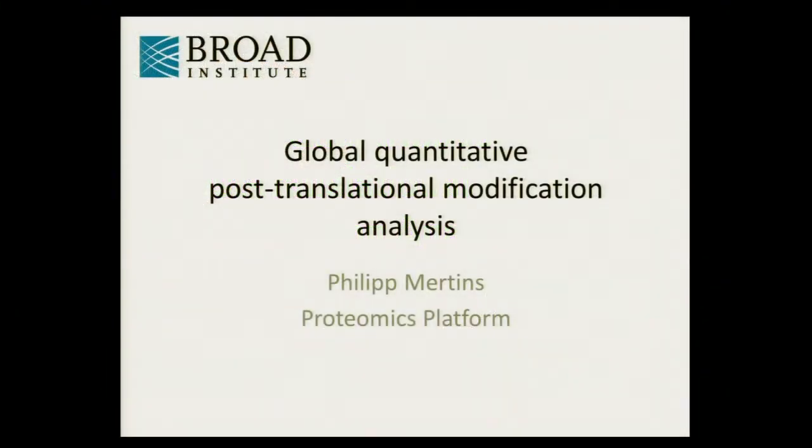In this talk, I want to show you how we use global quantitative mass spectrometry to do post-translational modification analysis. And if you have any questions about it, please interrupt me, and we can also make that more interactive.